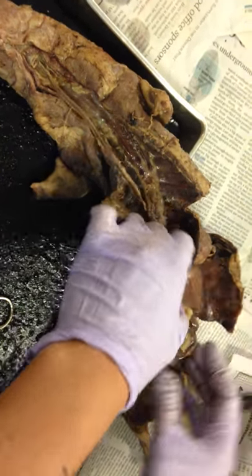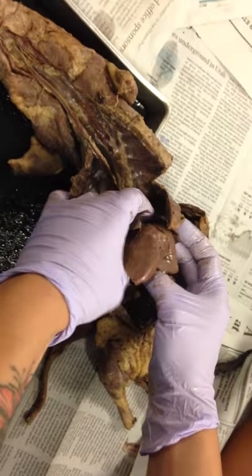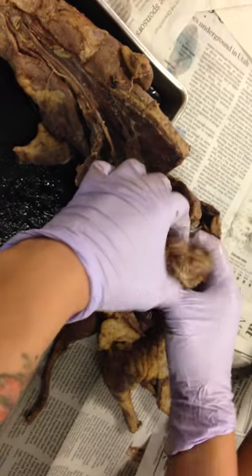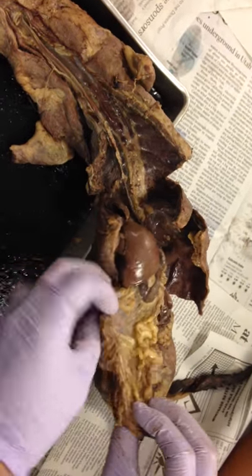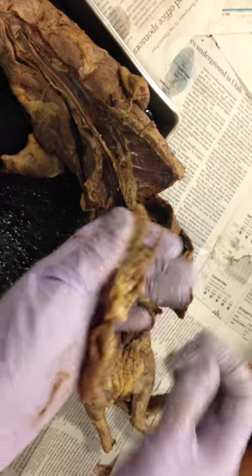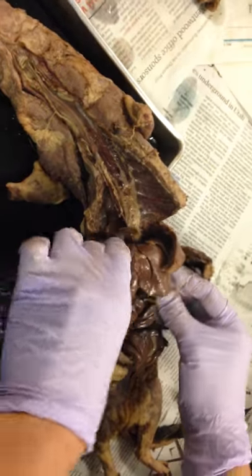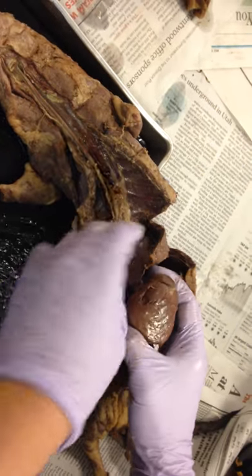Now the other problem that we have to remedy real quick is my liver is kind of in the way. So if you haven't already removed your greater omentum, you can remove that. Since it's fat, it's very delicate, and you can just remove the whole blanket off in one piece. And now I have to remove my liver.